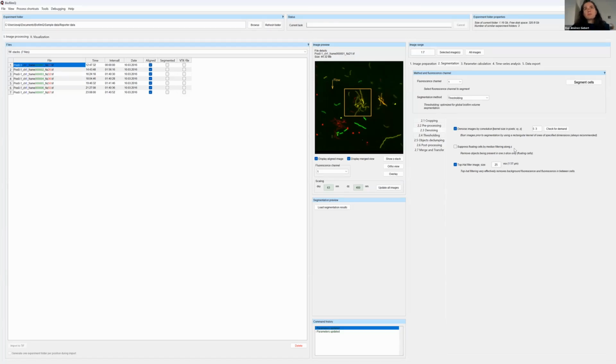In general, while doing image analysis, it's always very, very important to get a visual feedback on what you're doing, because your algorithm is most likely always going to segment something, but it's not going to tell you, hey, I'm segmenting something that I should not be segmenting. It's just going to give you some number. And if you don't actually check that it's doing the right thing, then you might get some gibberish.